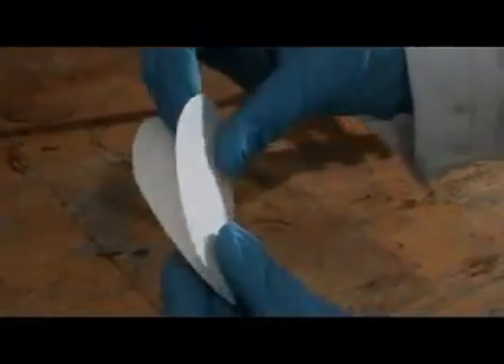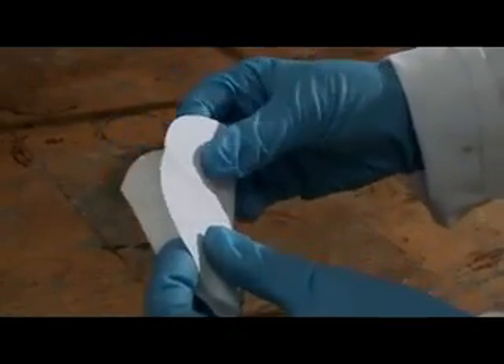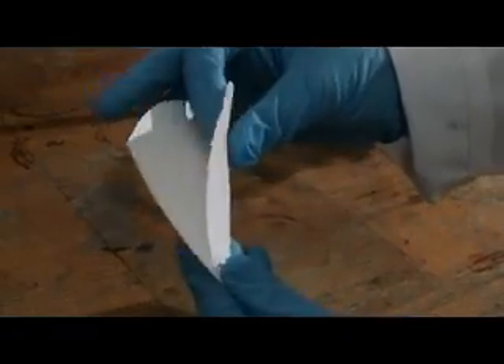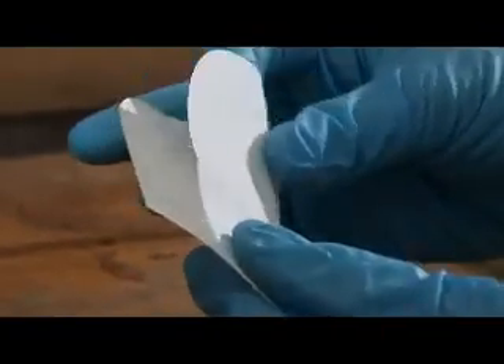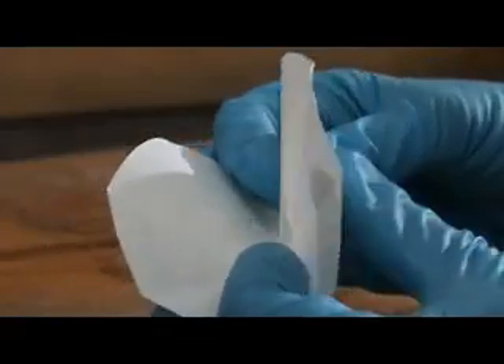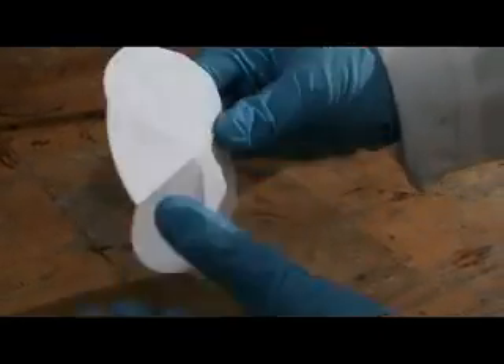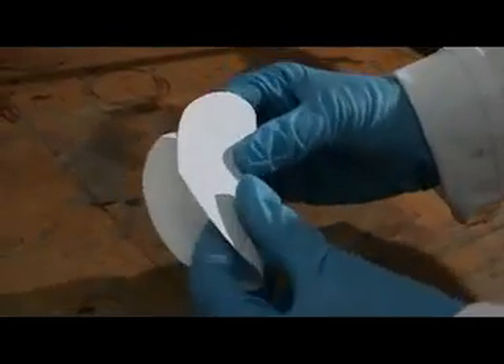To flute a filter paper, first fold in half, then in quarters. Now make a fold in between those two folds, and again between the other two folds. Now turn the filter paper over and make a fold in between each of the folds from the other side.